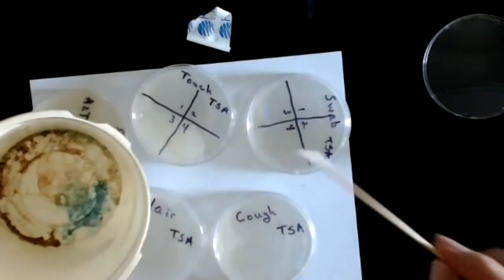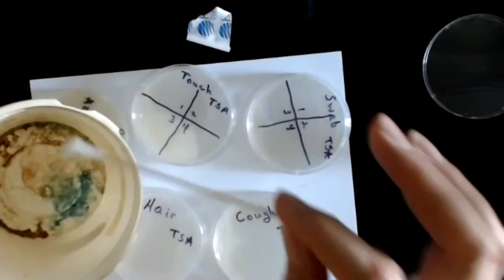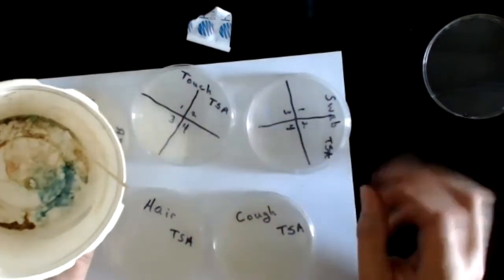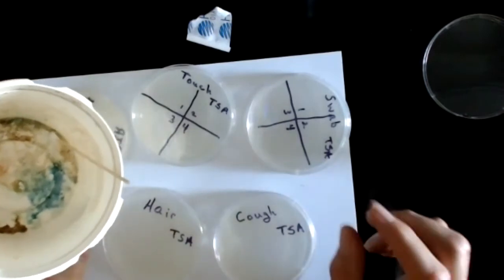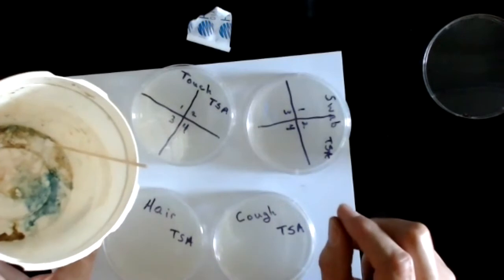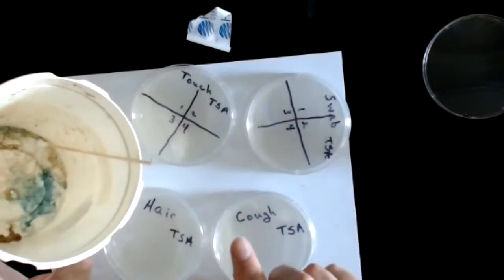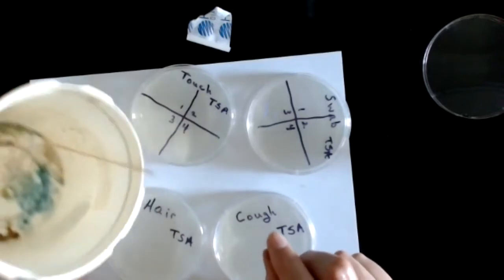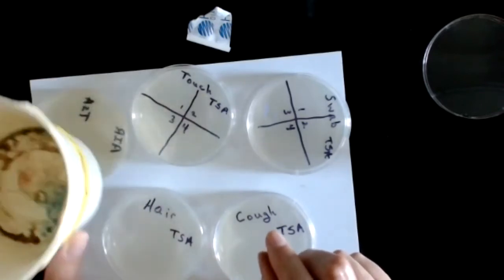Obviously, it's been used a lot. And I will throw the contaminated swab into that container. Anything that has been contaminated while used in the microbiology laboratory needs to have a place to be disposed of. In this case, contaminated swabs are thrown away in a plastic container similar to this one.